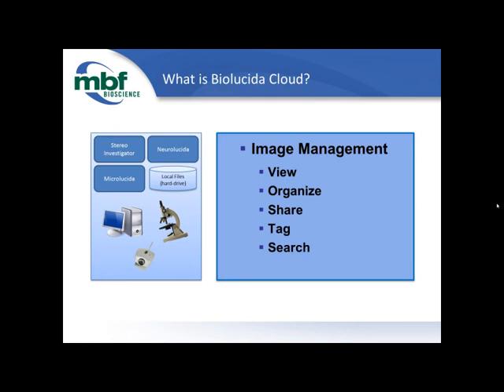Now, on the left of your screen right now is a simple graphic, and that's meant to depict the situation where software such as Stereo Investigator, Neurolucida, Microlucida are interacting with image files on one system. You capture image data. That data is then saved on the same computer, and then you open it back up and work on it. An example of this would be when a researcher, say, captures a 3D virtual tissue on a workstation, and then they open that image right back up and start working.